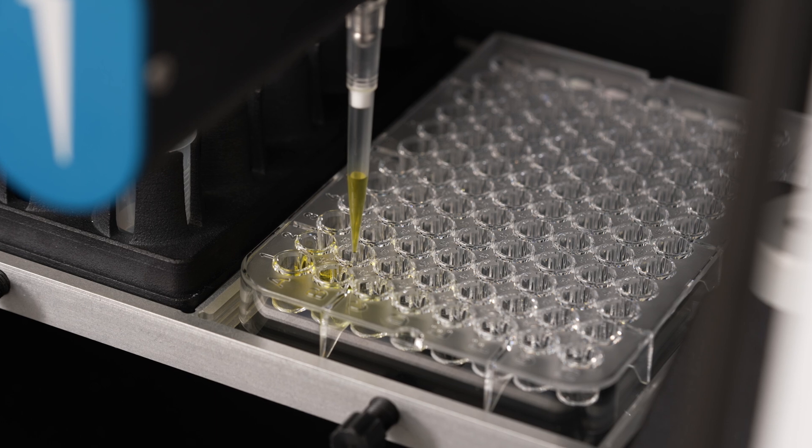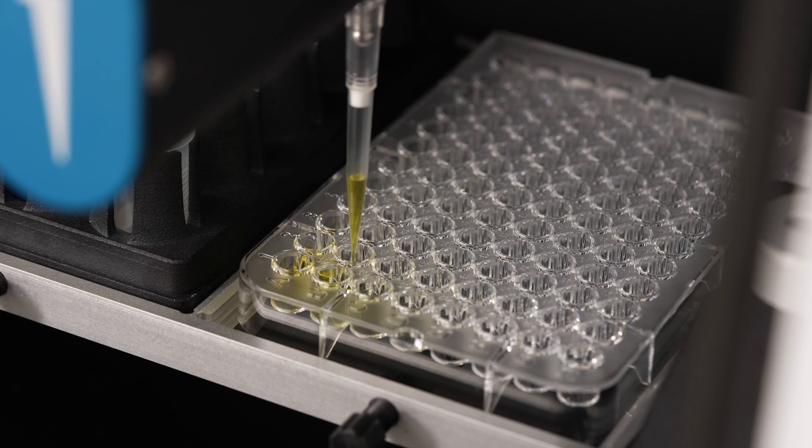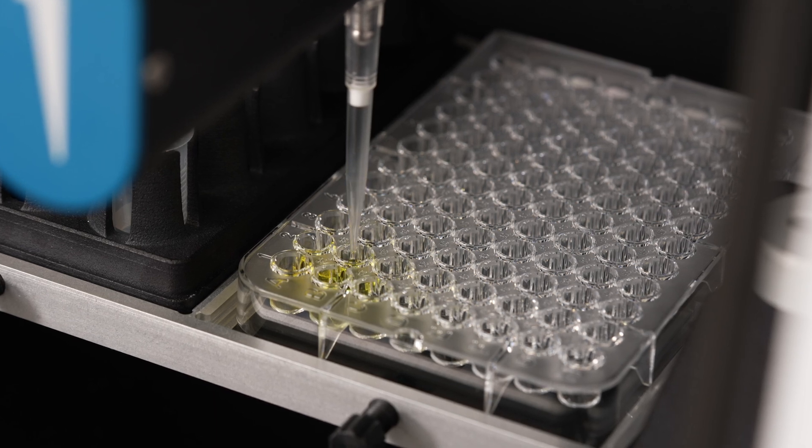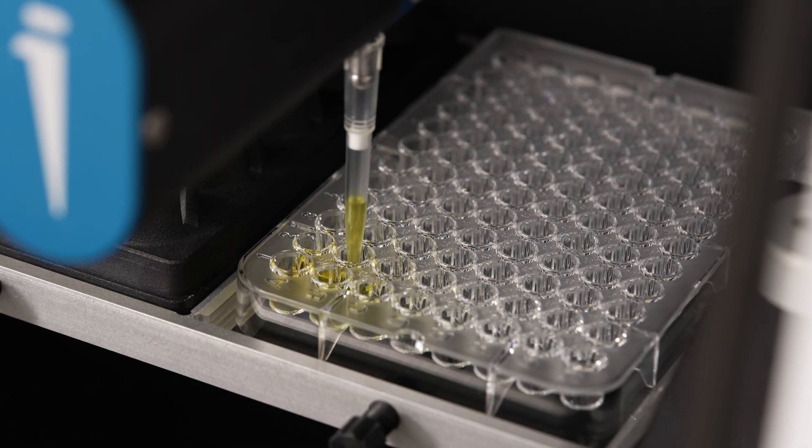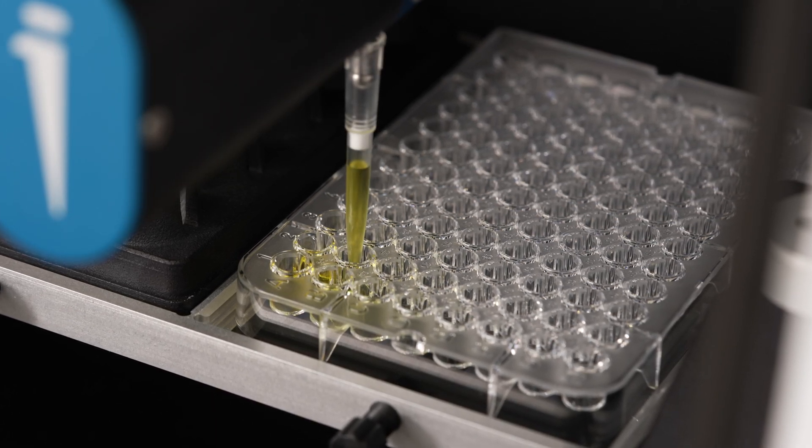Advanced parameters allow you to control aspirate and dispense flow rates, liquid level detection, and mixing options.